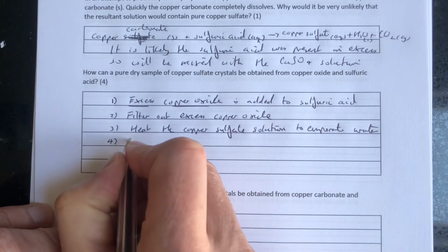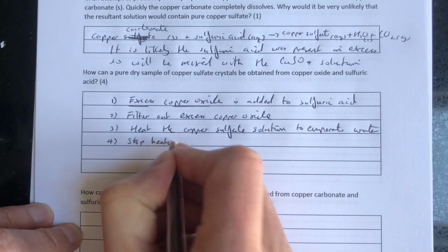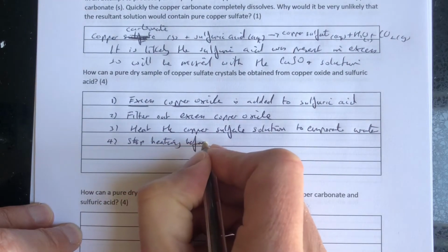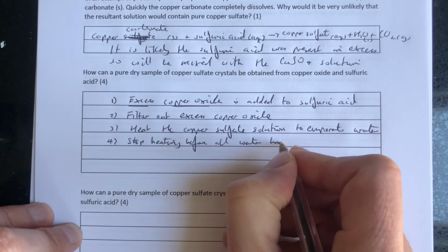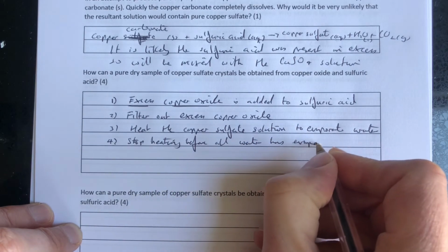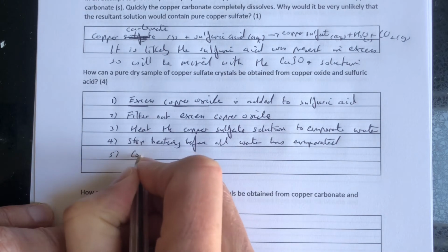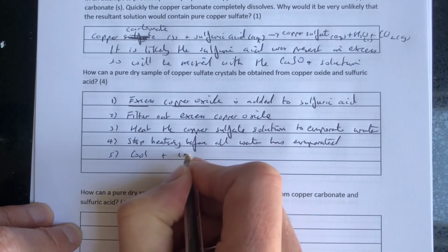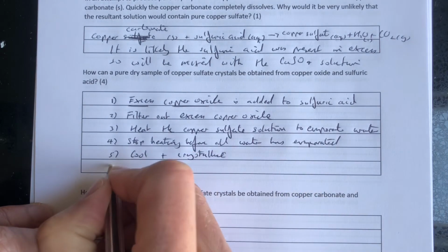4, stop heating before all the water has evaporated. We don't evaporate to dryness. 5, cool and crystallize. This process is called crystallization, so it's good to get this word crystallize in.